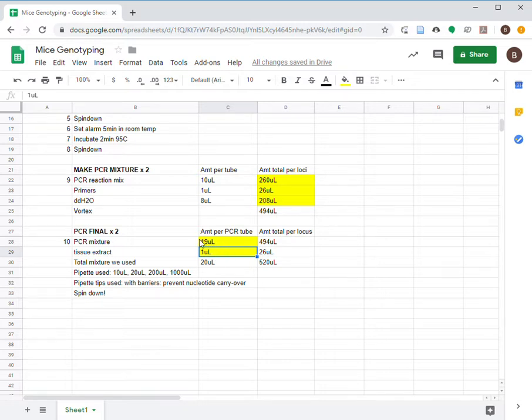Spin the solution down to make sure that there is no bubbles. Then, we are ready for the PCR machine.